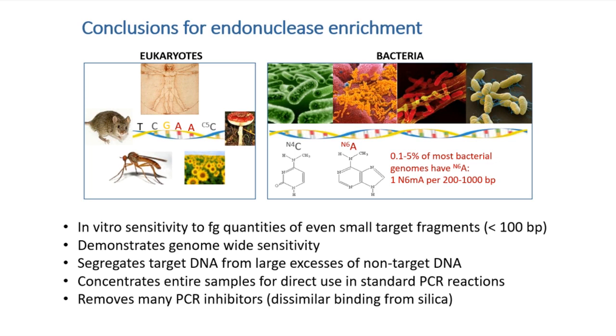I think I only showed you 2 restriction enzymes in today's work. I think we've published on maybe 5 or 6. This technique we've shown is sensitive to small fragments. The smallest one I showed you today might have been that 477 base pair fragment in the agarose gel. I think we've done gel shifts on fragments of about 20 base pairs. And I showed you several cases where we're sensitive to femtogram quantities, or essentially a single cell's worth. We actually think we probably have about a 70% chance of binding each fragment in a mixture.